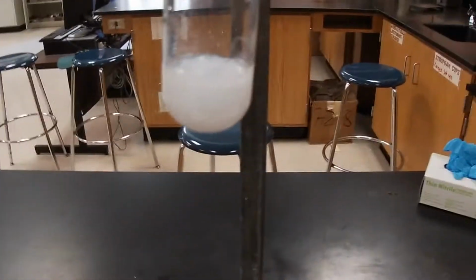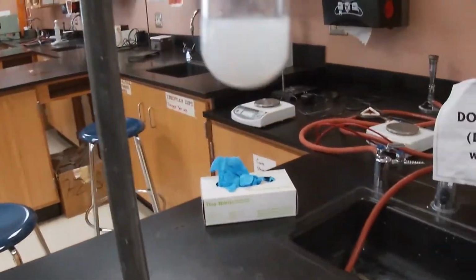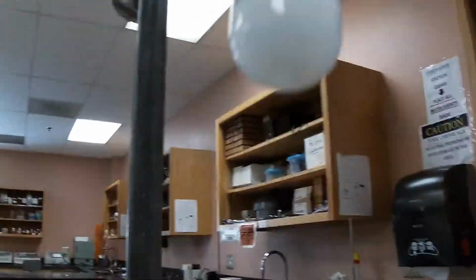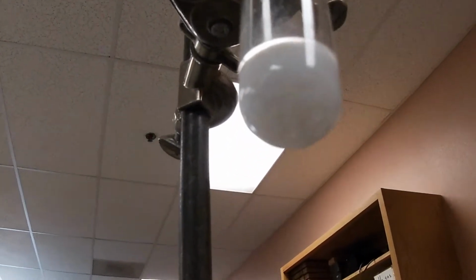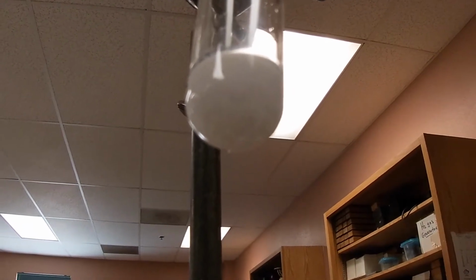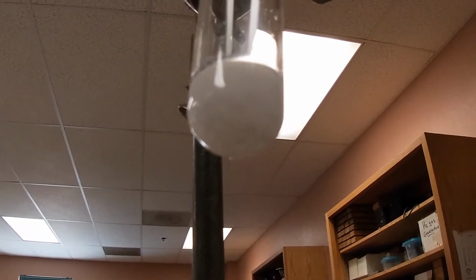If you notice, as we added the sodium chloride, our solution got nice and cloudy. Hopefully you can see it from the bottom. You see those crystals forming, and there is your insoluble product right there. This is the mixing of silver nitrate and sodium chloride.